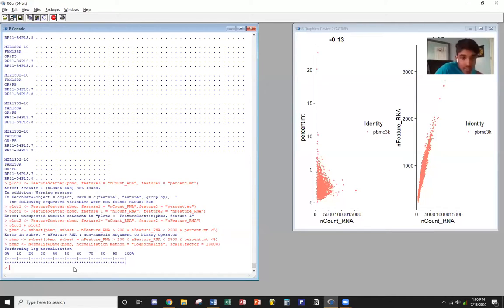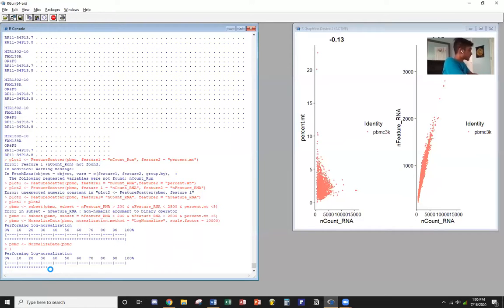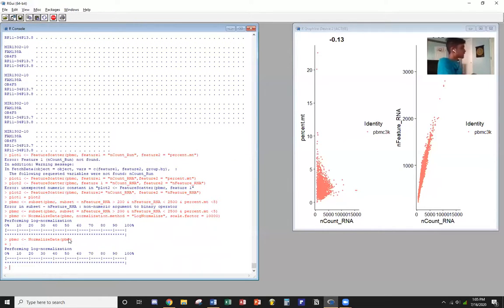Okay, and sometimes people will think this is a little bit too long, so you can also do it like this: pbmc, NormalizeData, and the parentheses, much simpler. But it offers a readability issue though, like clarity essentially. So now let's go on.